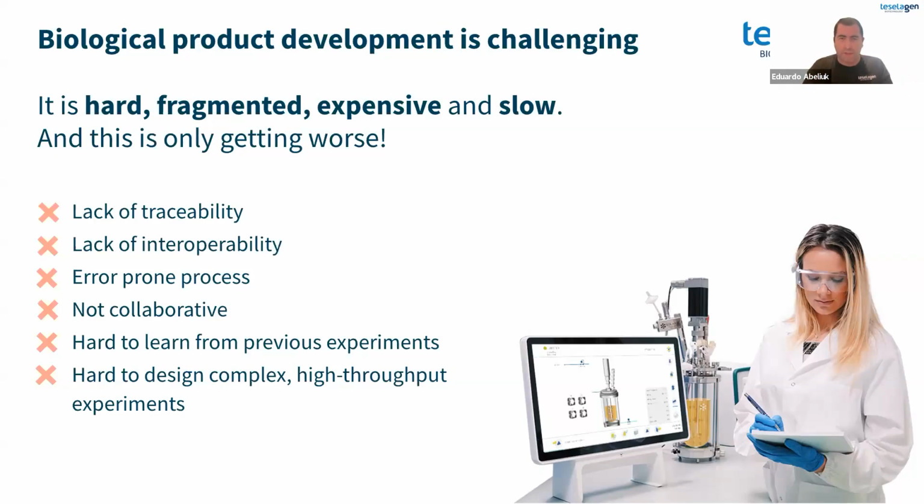These limitations make it very hard to iterate quickly, to connect insights across workflows, and to learn effectively from prior work. And moreover, biological product design is by nature, we believe, an iterative process which requires the ability to systematically track and connect every stage of development from design through build to phenotypic testing so that data and learnings can flow seamlessly throughout the entire cycle.